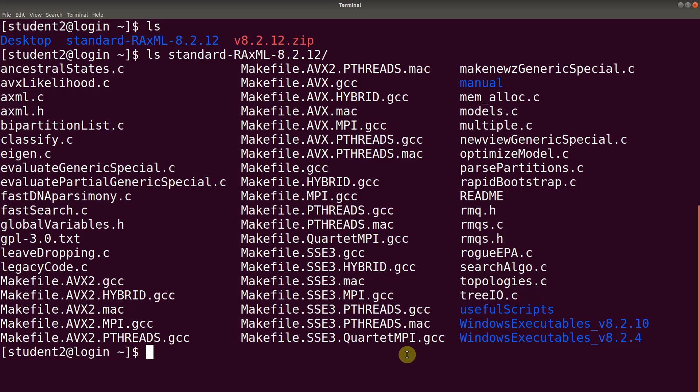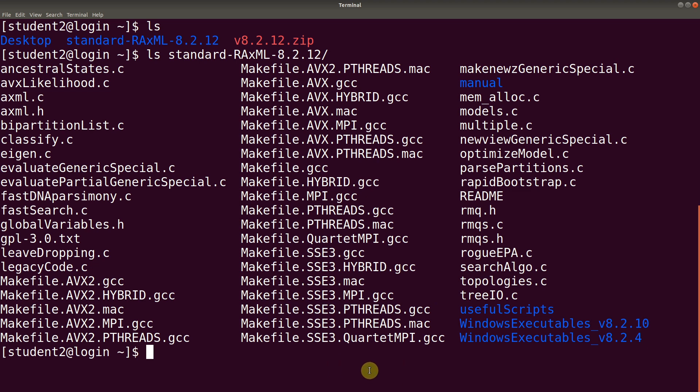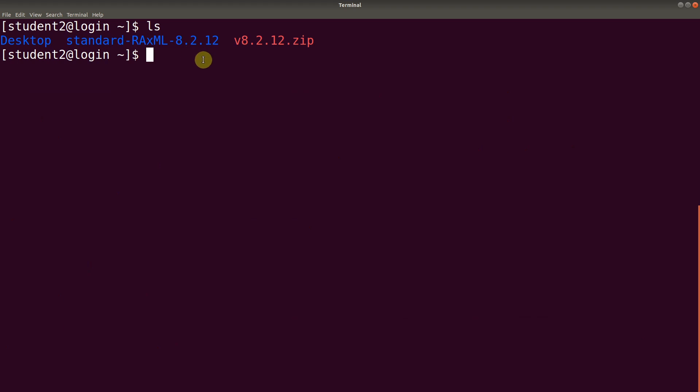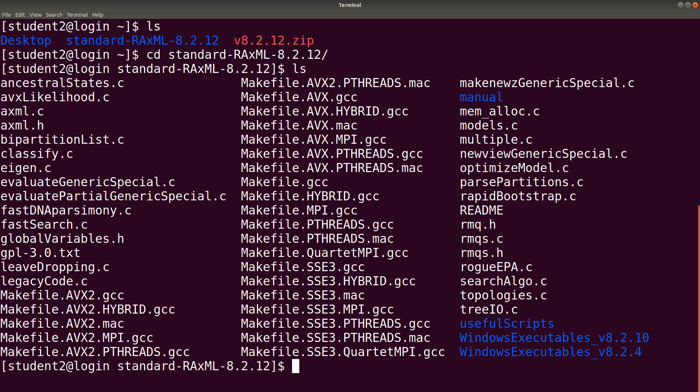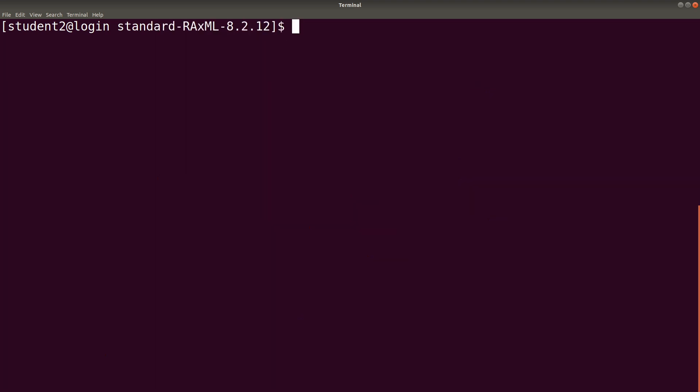So let's go back to the terminal and do the compilation. Based on the information that we've discussed, I will go for this particular file here and compile, because I also have GCC installed. Let's clear the screen first. We will cd to this directory, the one that we unzipped. So we say cd standard. Let's do an ls again. Our target is this one.